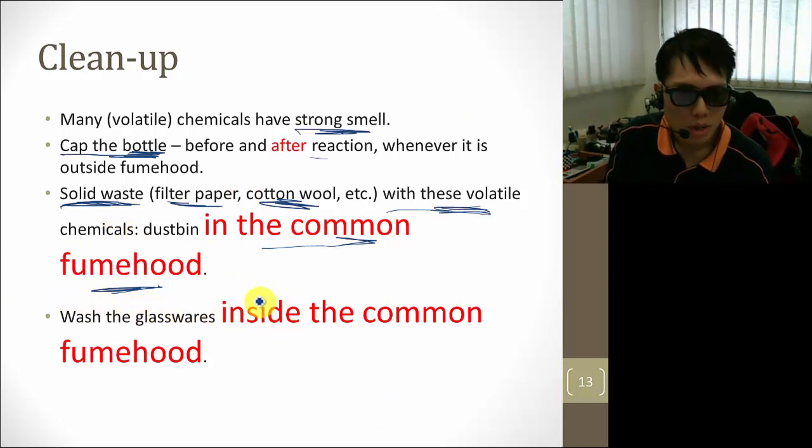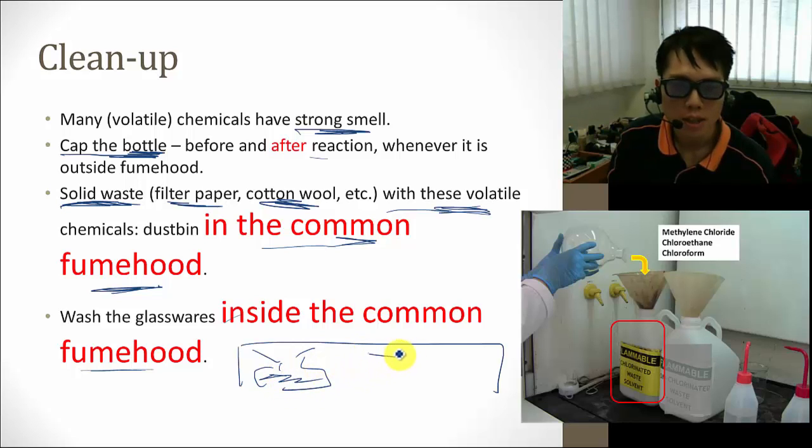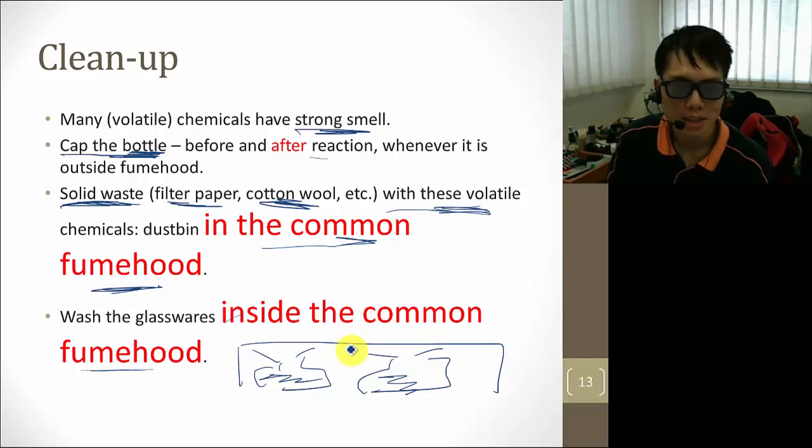And wash the glasswares inside the common fume hood. The common fume hood is the one that's quite big, and you have some waste solvents here, chlorinated, non-chlorinated. Okay, wash it inside, don't wash it outside.